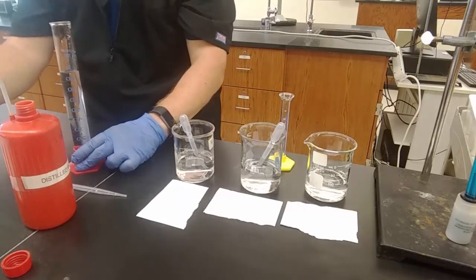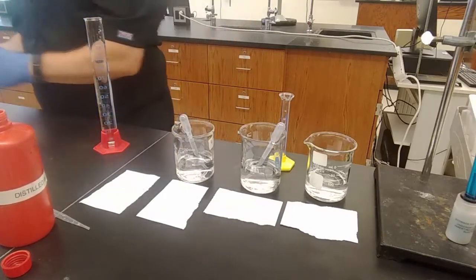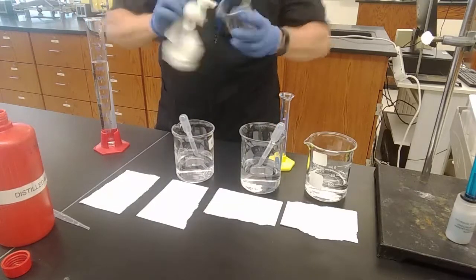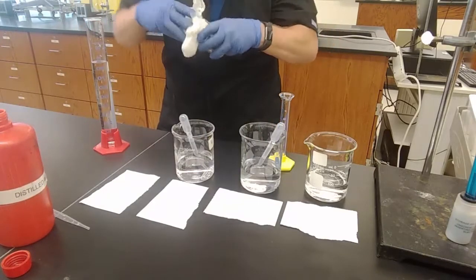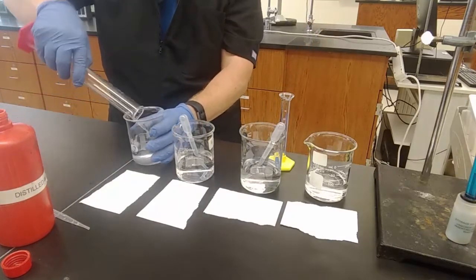This is going to be a 4. Another beaker.